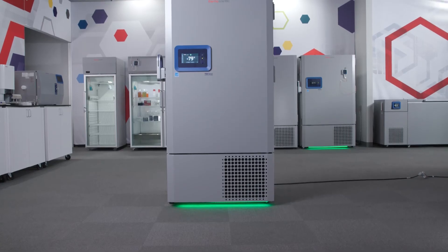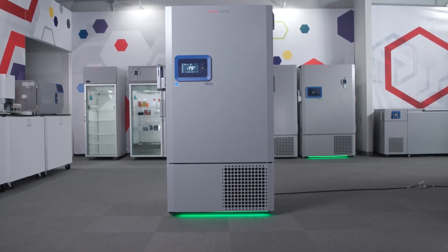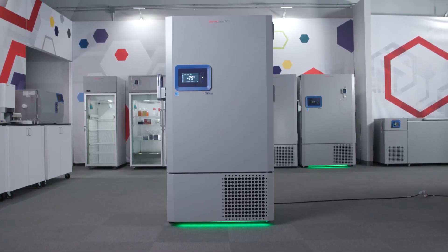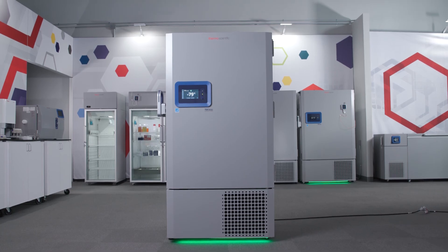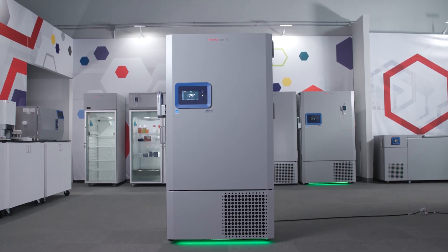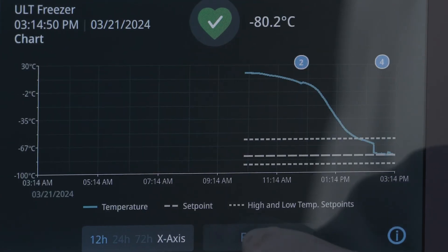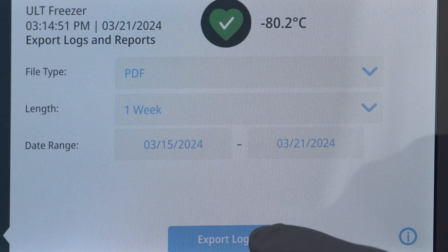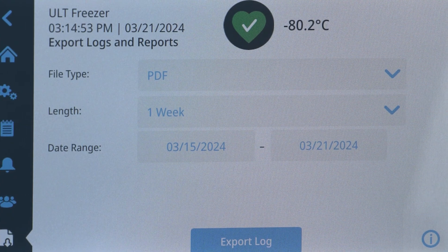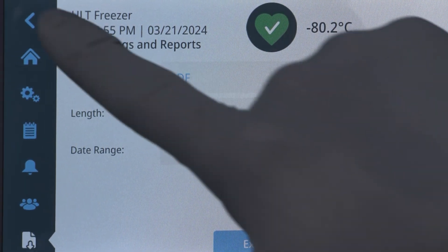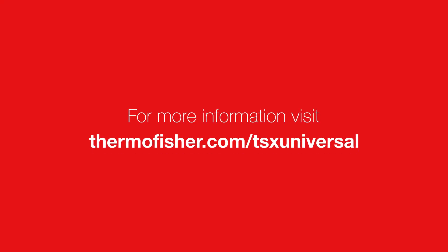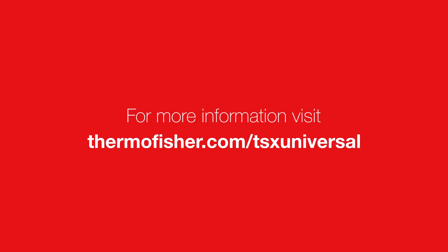What we reviewed is just a small portion of the feature sets within the TSX Universal ULT Freezer user interface. With its user-centric design, simple efficient operation is literally at your fingertips. For more information, visit thermofisher.com/TSXUniversal.